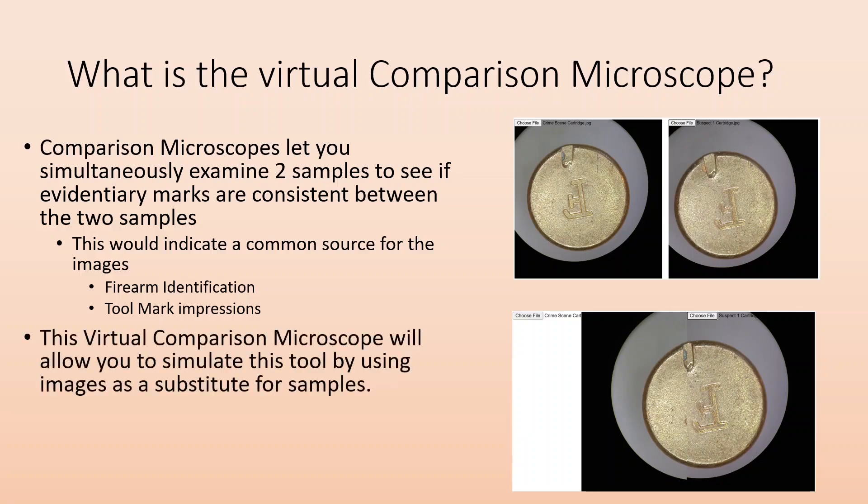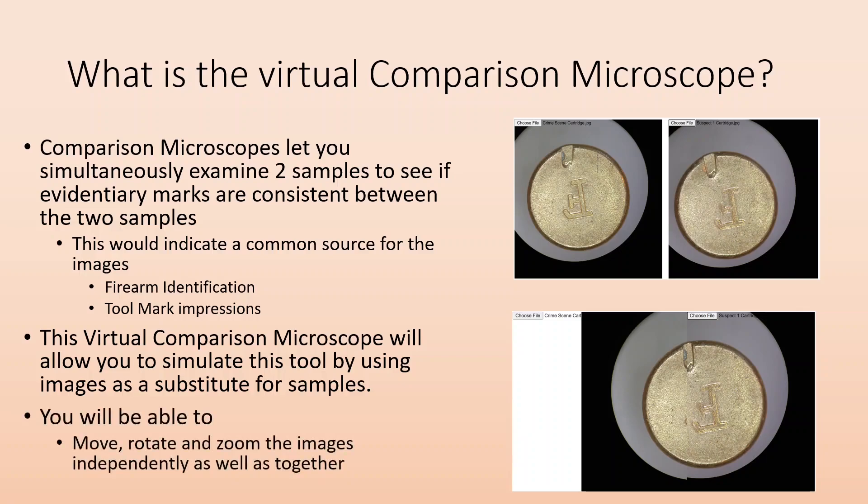So the virtual comparison microscope will allow you to simulate this tool by using images instead of the actual samples. Basically you'll just manipulate a picture instead of the actual thing. You'll be able to move, rotate, and zoom the images independently as well as together.